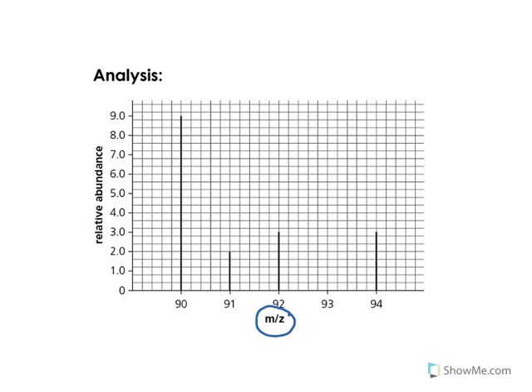So on this x-axis down here is m over z. That refers to the mass to charge ratio, and that's important because occasionally the charge on the ion might not be +1. It's usually +1, and therefore most of the signal will relate to just the relative mass of the particular substance. So on this particular diagram, we've got the relative mass on the x-axis, which is the same as the mass to charge ratio because the charge was +1. And the relative abundance goes on the y-axis here.